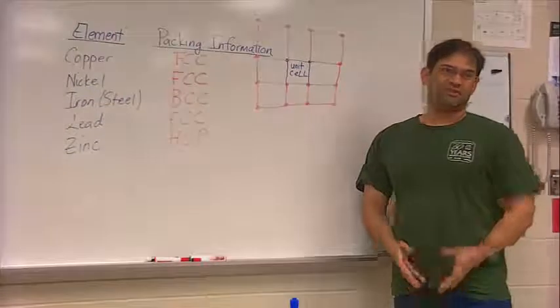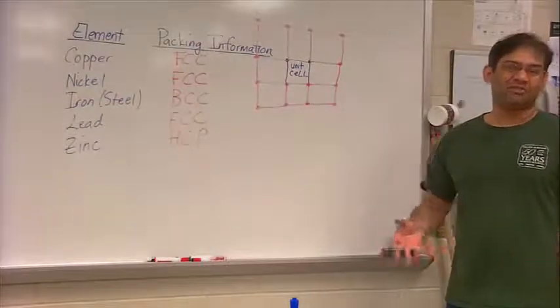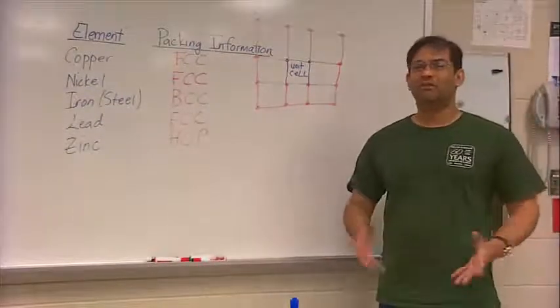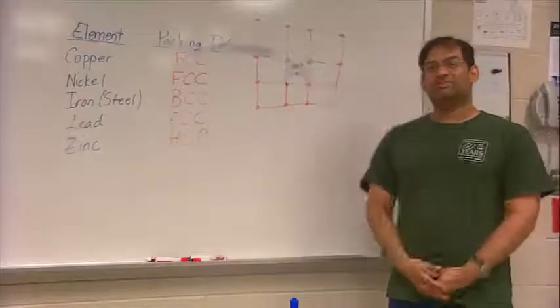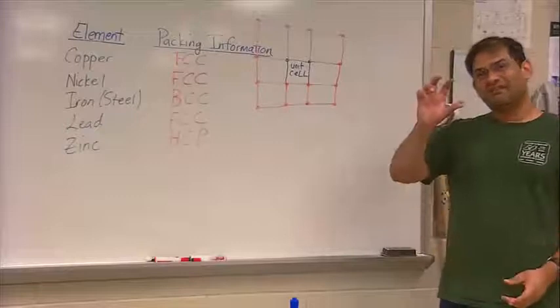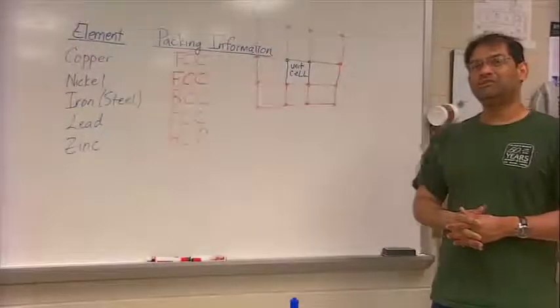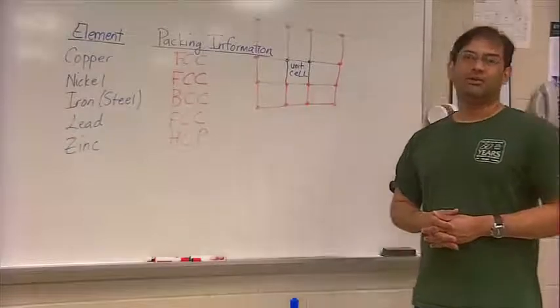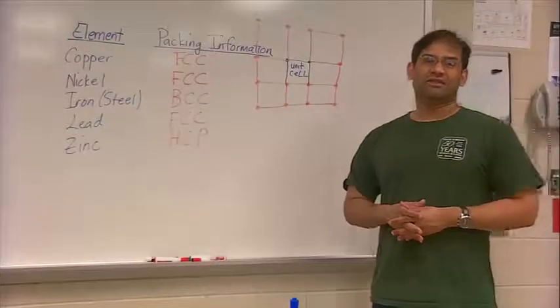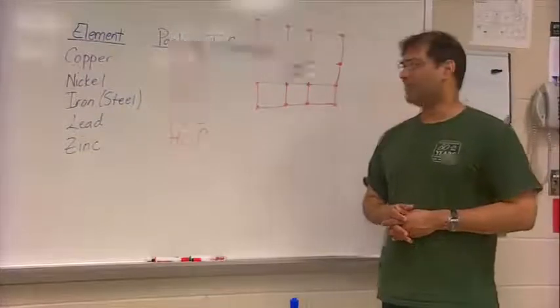Do the same procedure as we've done before. Weigh out a certain amount of metal, a good amount, and slowly put that in a graduated cylinder that already has some volume. Measure the volume displacement, and that will be your volume. Density is equal to mass over volume. Fill out that table in your results section of your lab.